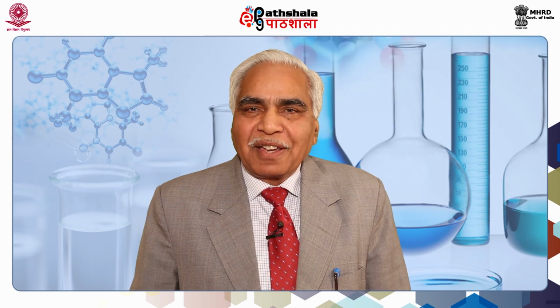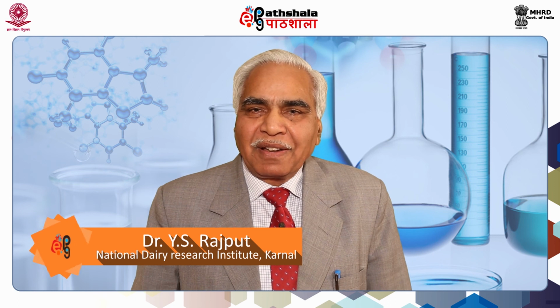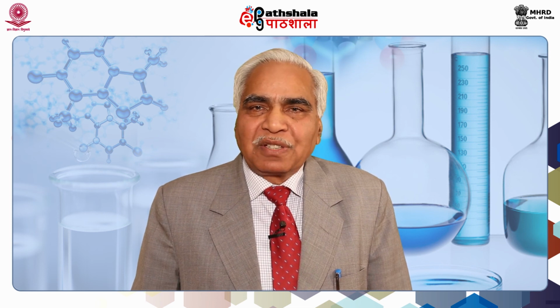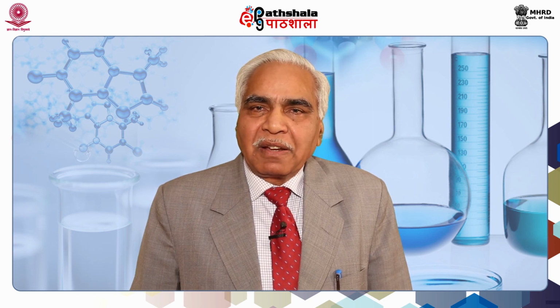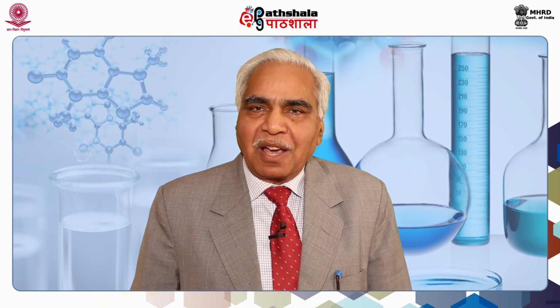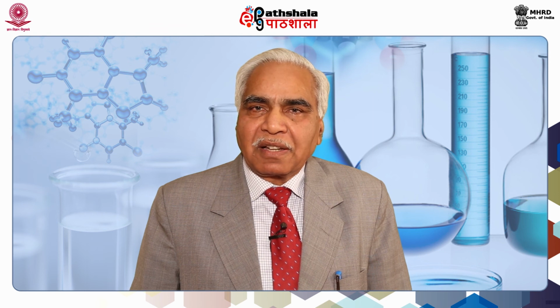Dear students, if I want to summarize the technique of isoelectric focusing, I made it very clear that this technique has high resolution power, and if two proteins differ in their isoelectric point, these can be separated. Proteins which differ in phosphorylation, proteins which differ in glycosylation, that is most of the situation with the isoenzymes. So these can be easily resolved in isoelectric focusing technique.